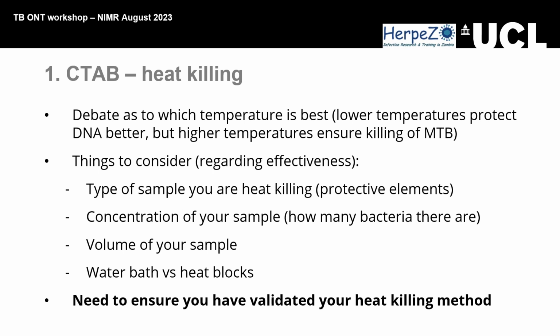So, water bath versus heat block. For me, I feel using a heat block denatures the DNA. In an Eppendorf tube, we have bacteria up there and down there, and the heating block usually gets very hot on the bottom and not the upper side.